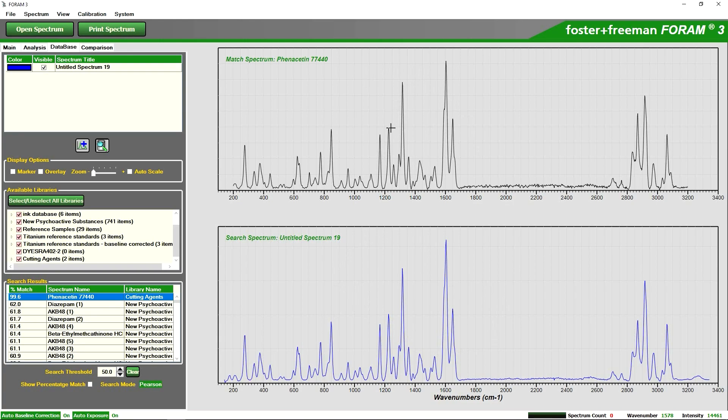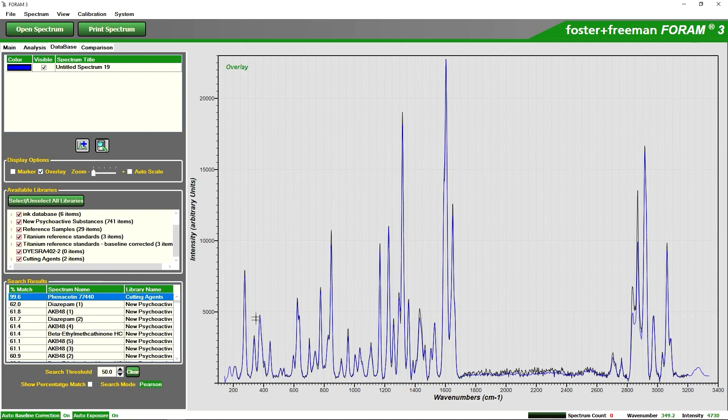Here I can click on overlay and we can quite clearly see that these spectra are almost identical. So we can be quite conclusive that this particular unknown compound is phenacetin, which is a very common cutting agent used in the manufacture of cocaine in various parts of the world.